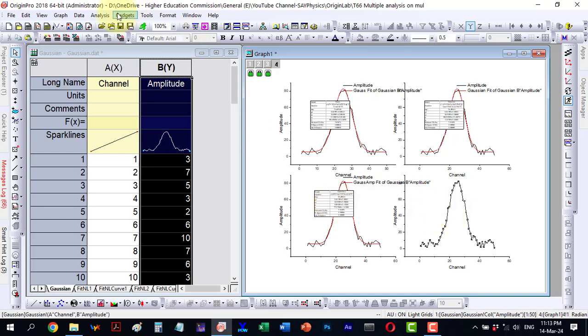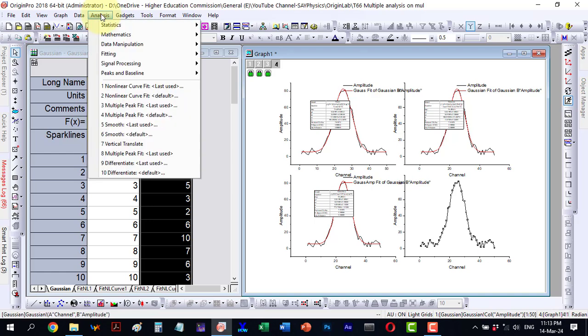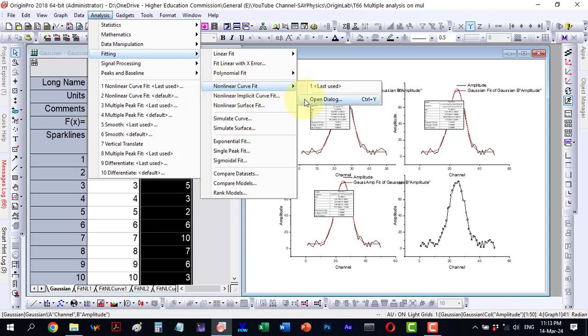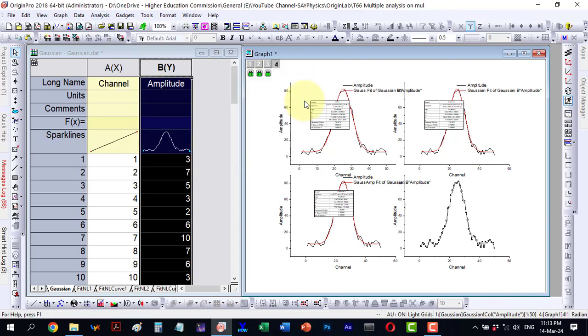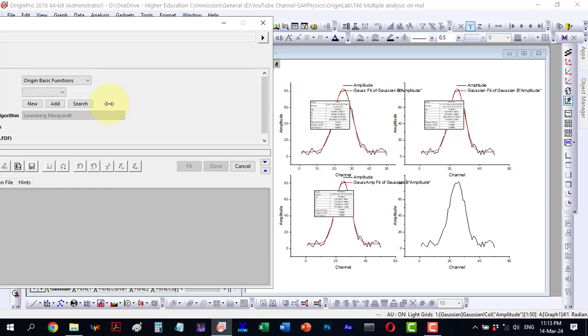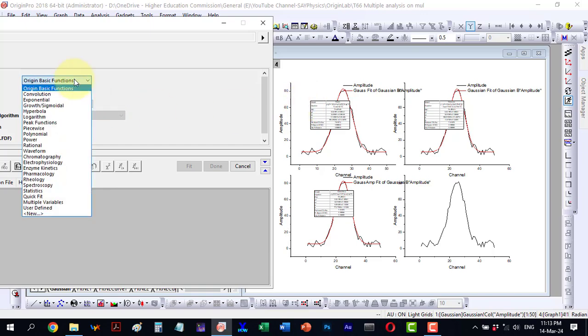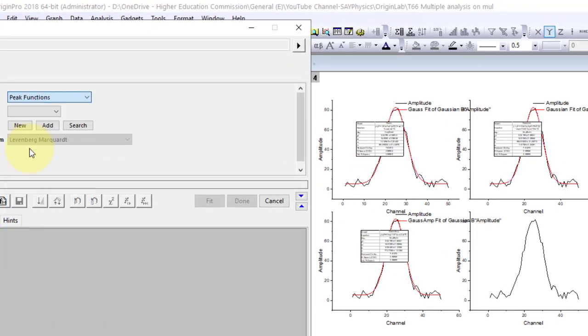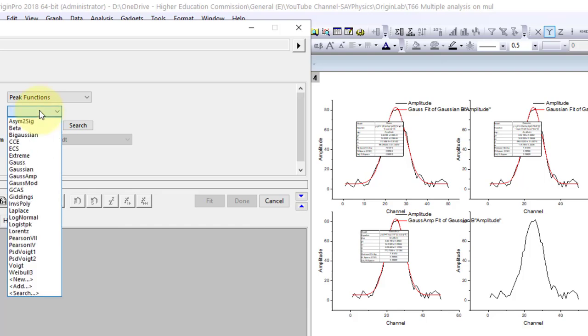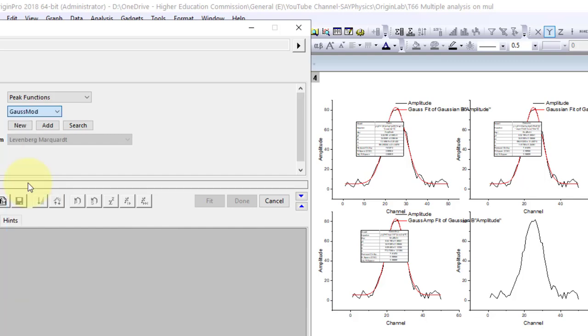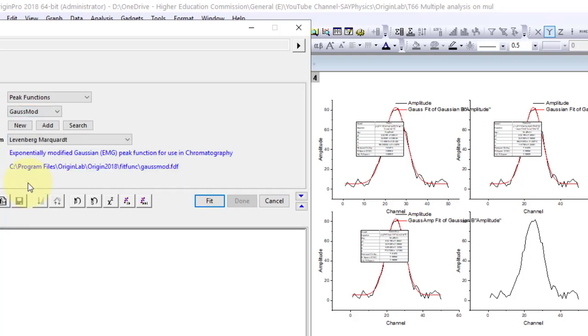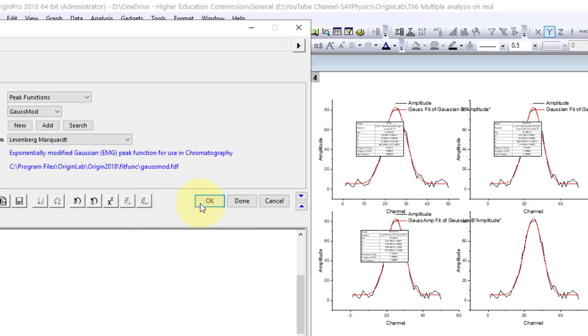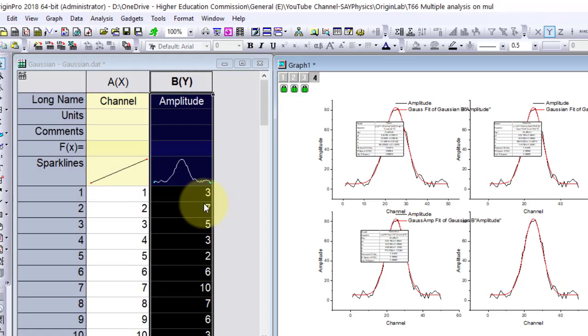Finally, I proceed with the last function. I go to fitting, then to non-linear curve fit and open the dialog. Here, under peak functions, I select the last one, which is the gauss-mort function. Now, it has completed the fitting. I perform some iterations to ensure a good fit and then continue fitting until convergence. After the fitting is done, I click OK. Now, we have all four data sets here.